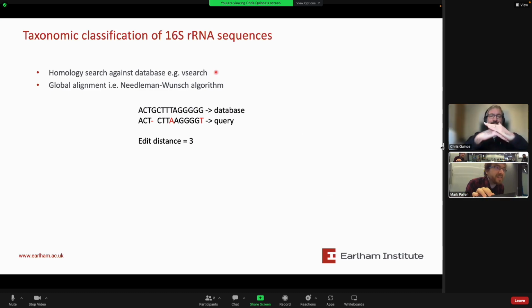All right, so a local alignment is when you're only matching a portion of the query against the reference, not the entirety of the query against the reference. It would be appropriate for when, say, you were aligning two genomes from the same species against each other because only portions of them will align.